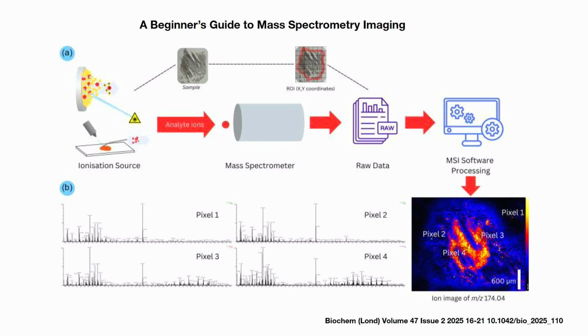Because of time, I don't have time to go through this, but you can also do mass spec, and then you have all the peaks that you got. You can put all this together and you can get imaging to do in 3D. You can do cutting down and do 3D imaging with this mass spectrometer. Again, we have a huge AI part of this project that's being constructed. We've already got people from our computer department who are very interested, and also Google probably will help us.